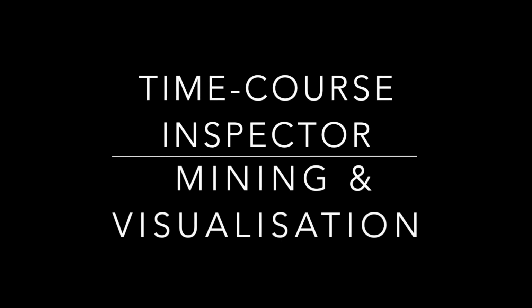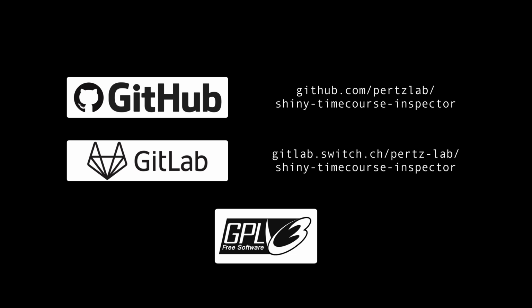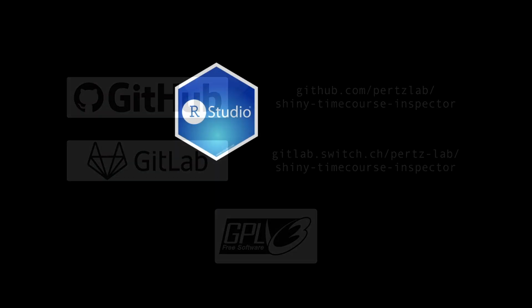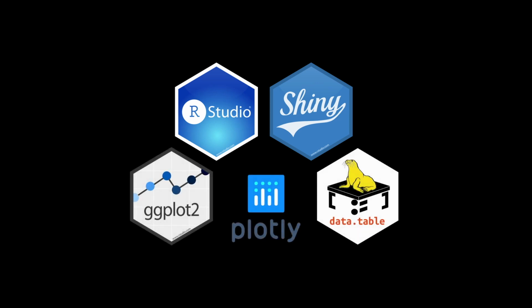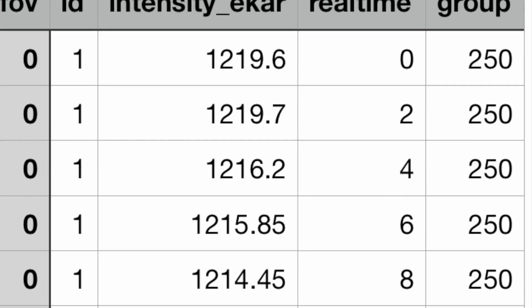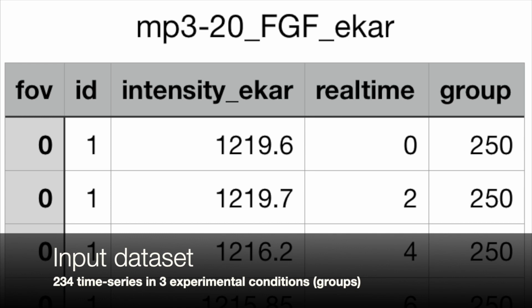Time Course Inspector is an open source app for analysis, mining, and clustering of time series data. We wrote it in RShiny, and the app can run locally in RStudio environment or can be deployed as a web application. The app accepts CSV files in a long or wide format. Here I will demonstrate it using a biological dataset from single-cell fluorescent time-lapse microscopy.